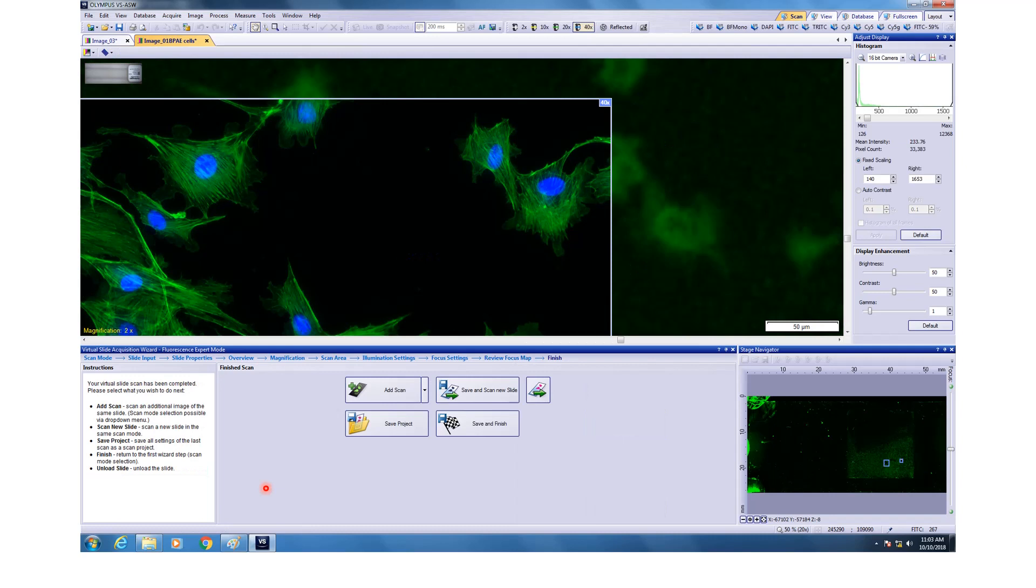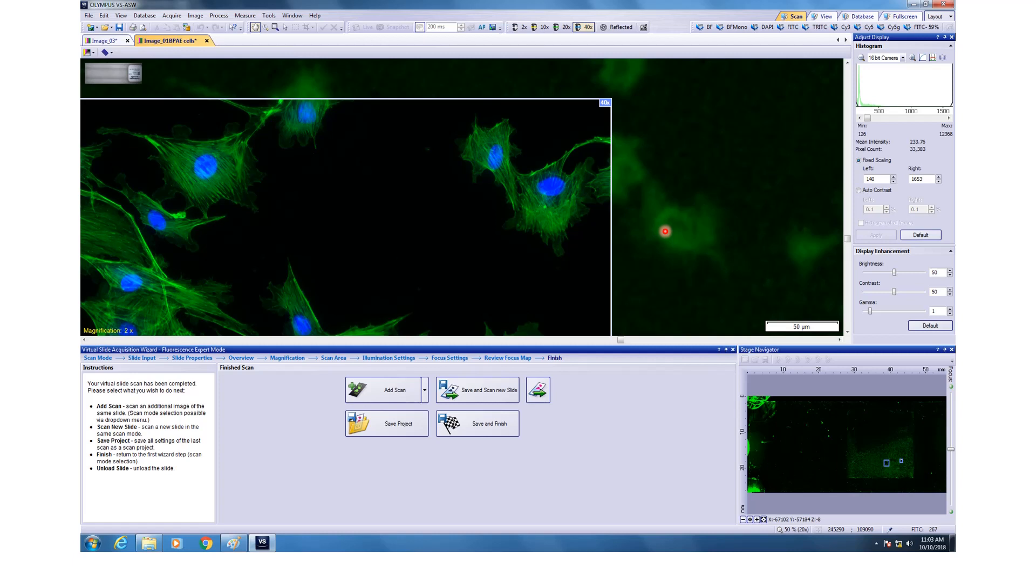After the imaging is done, you can see if you zoom in, you can compare the 2X versus 40X. You can see really nice patterns here which you couldn't have resolved at 2X. After the imaging is done, just like Brightfield, you can add more scans if you are not happy. If you want to image another area, you can add scan or you can save and continue to the next slide, or you can save and finish.